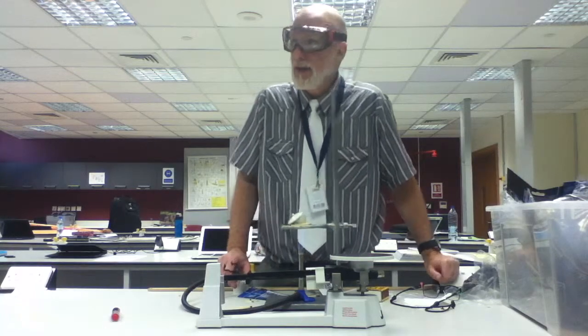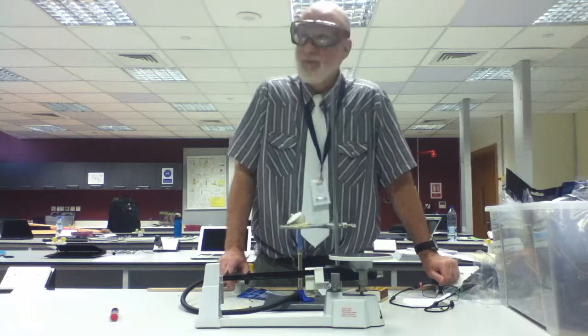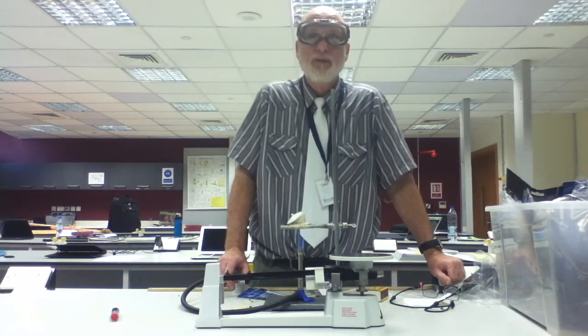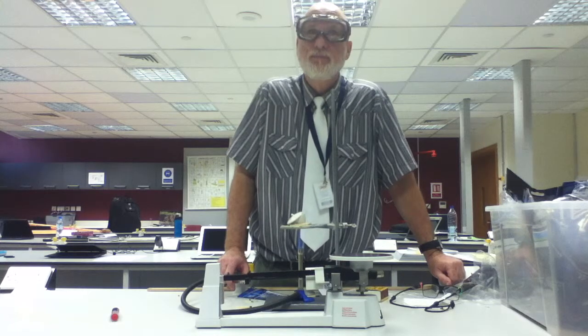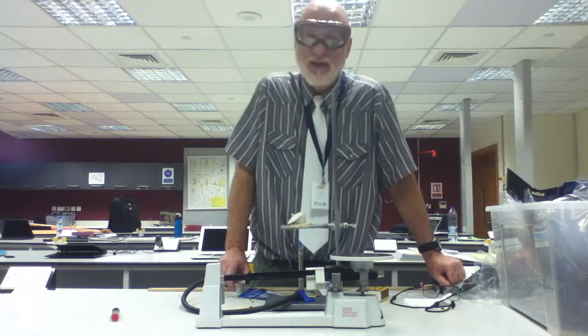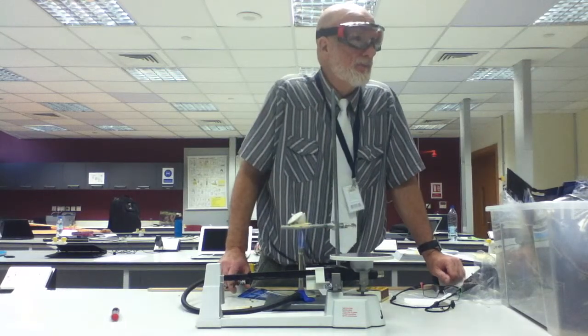In order to find the mass of the magnesium oxide that you produced, what do you subtract from the mass of the lid, crucible, and magnesium oxide? Lid, crucible. The mass of what? Think, everybody. I know it's first period. They're very tired. What do you subtract from the mass? Yes? Anna? The lid and crucible.